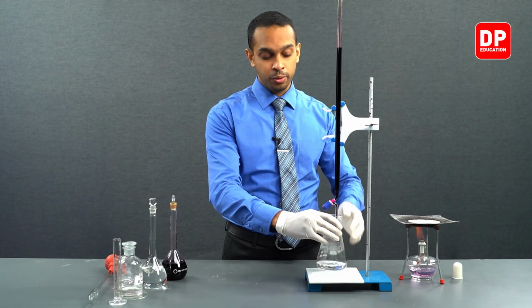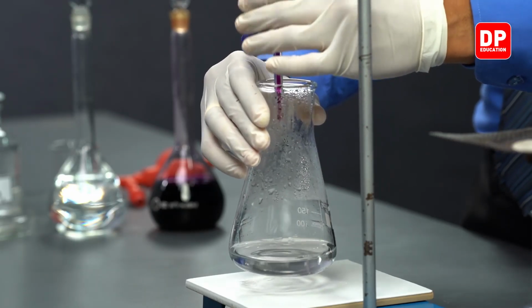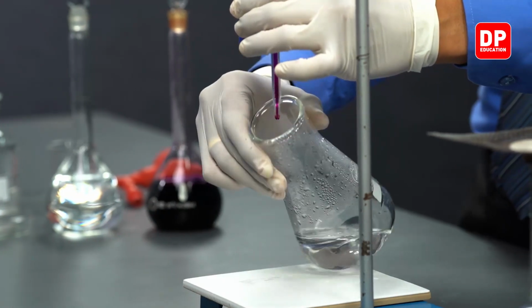The solution seems to have cooled down a little bit. So let us heat it up a little bit more.